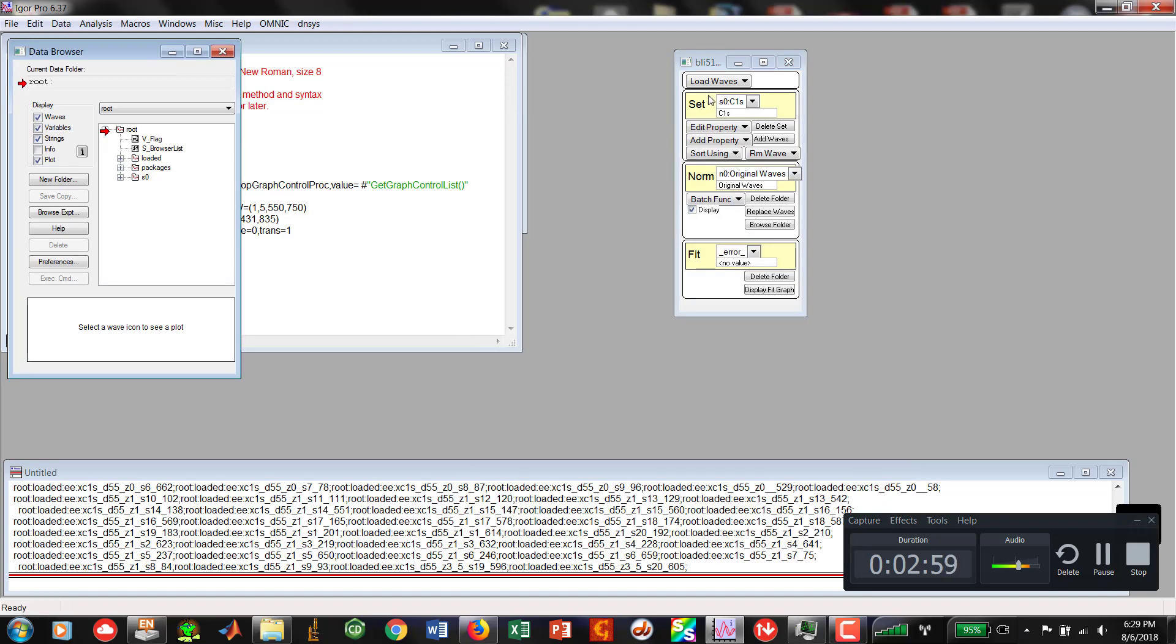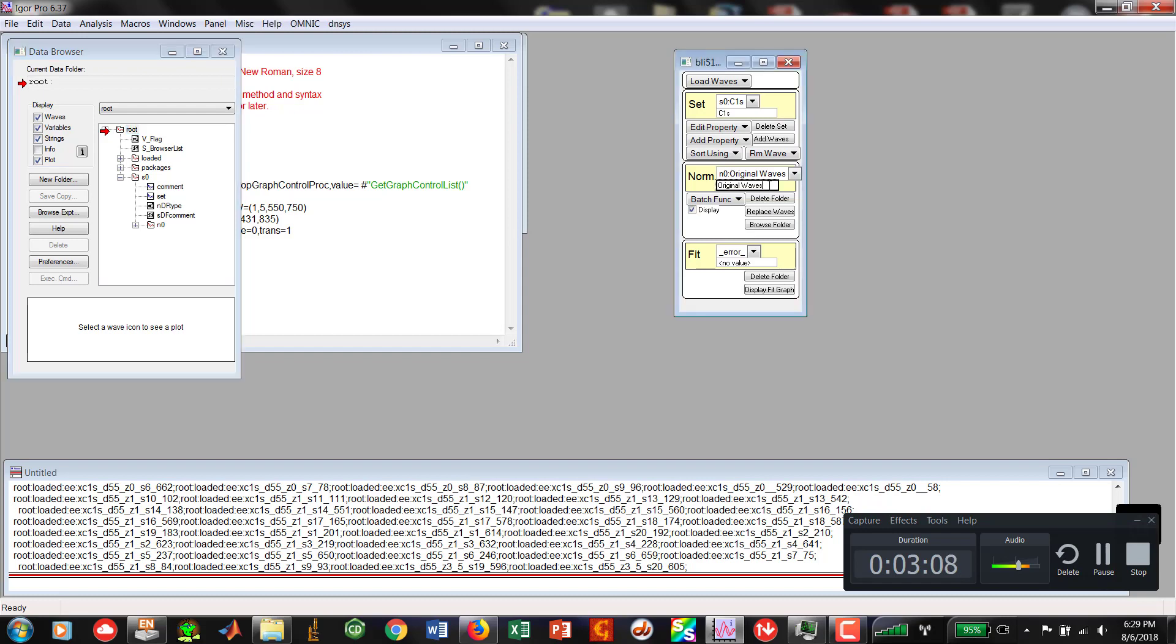That creates that new set. And you'll notice that the original waves, you just made an N0 wave. So if we clicked over here, you'd see N0. So that is our EE. So we can go ahead and just call it EE. And then hit Enter.